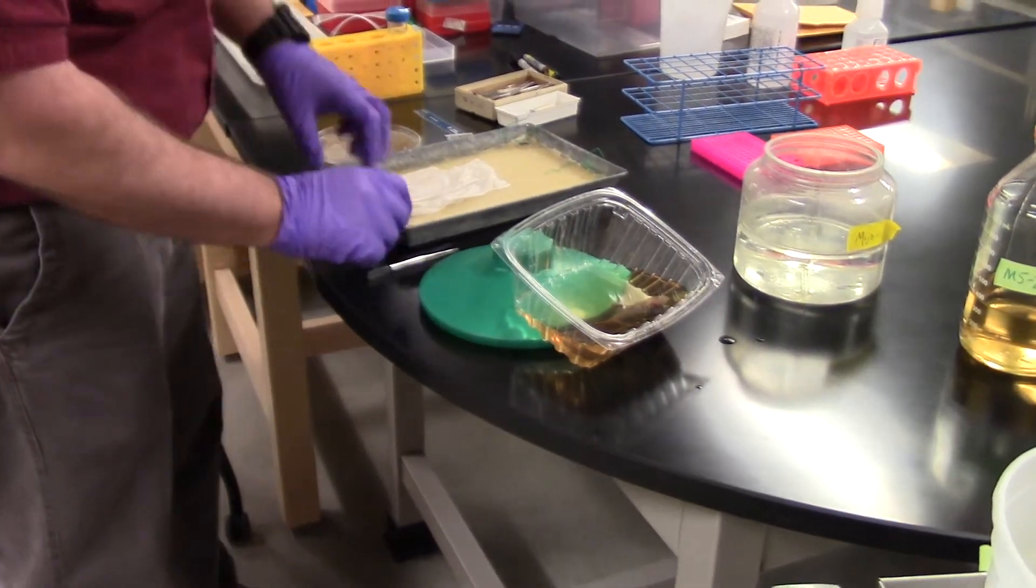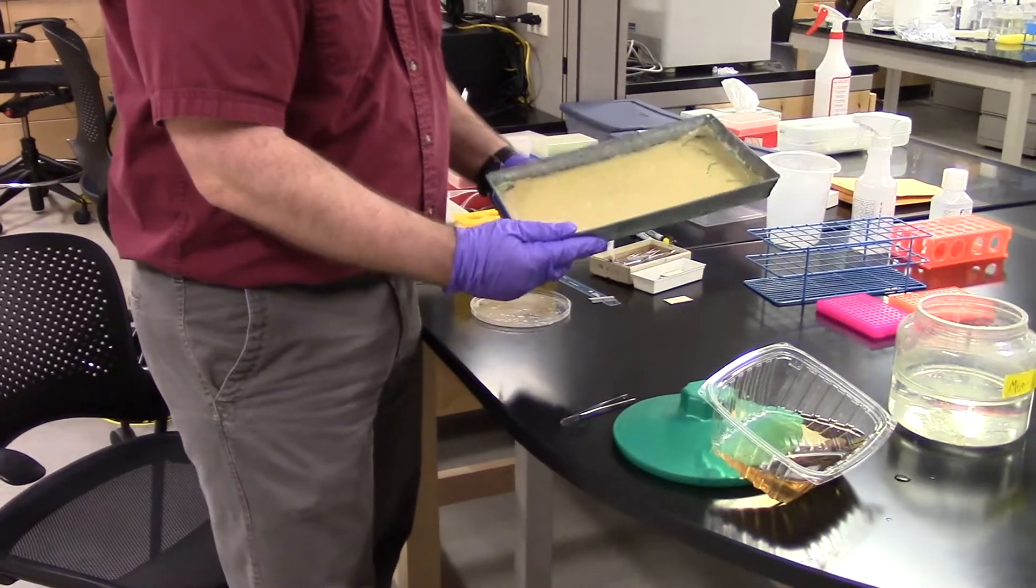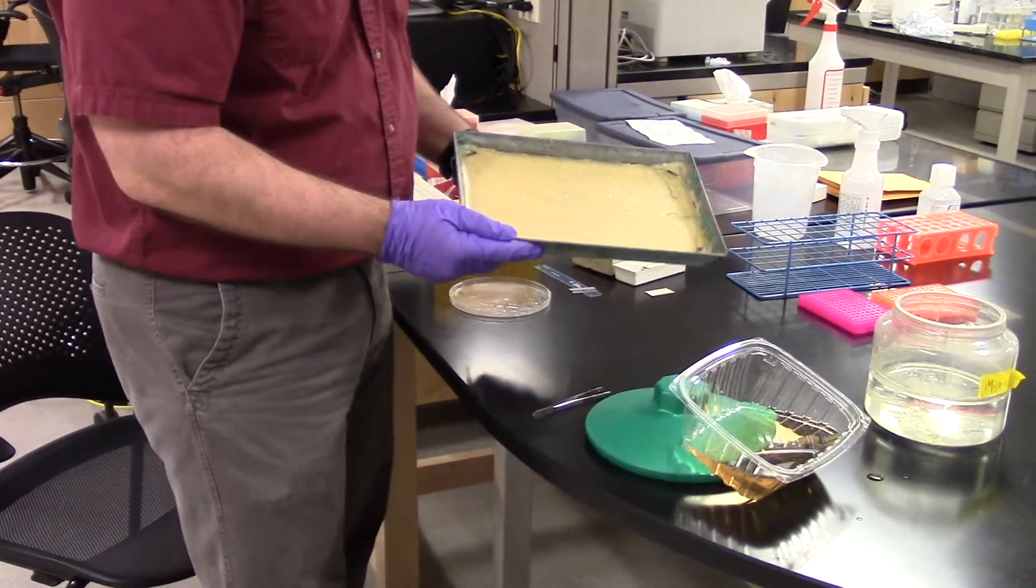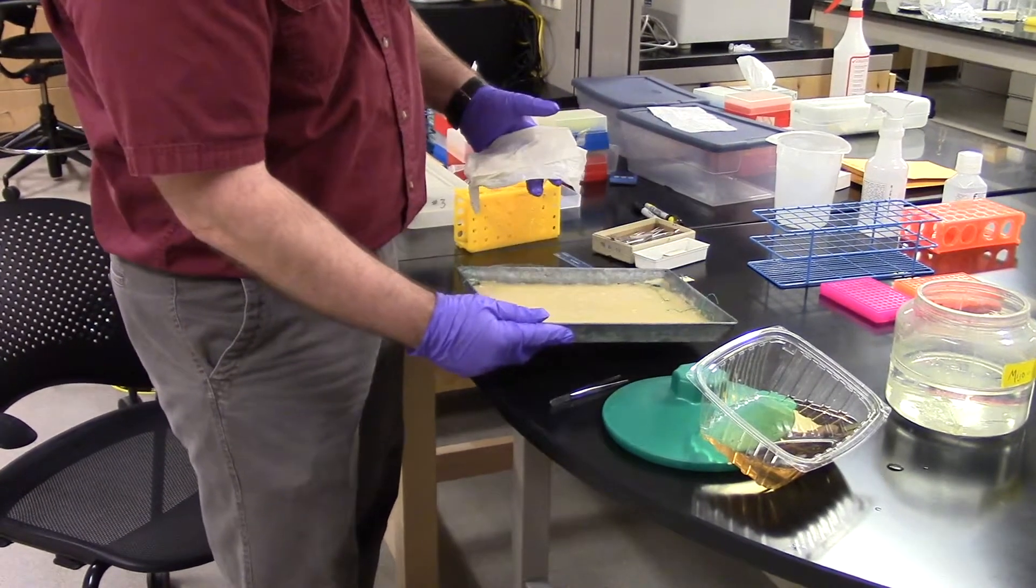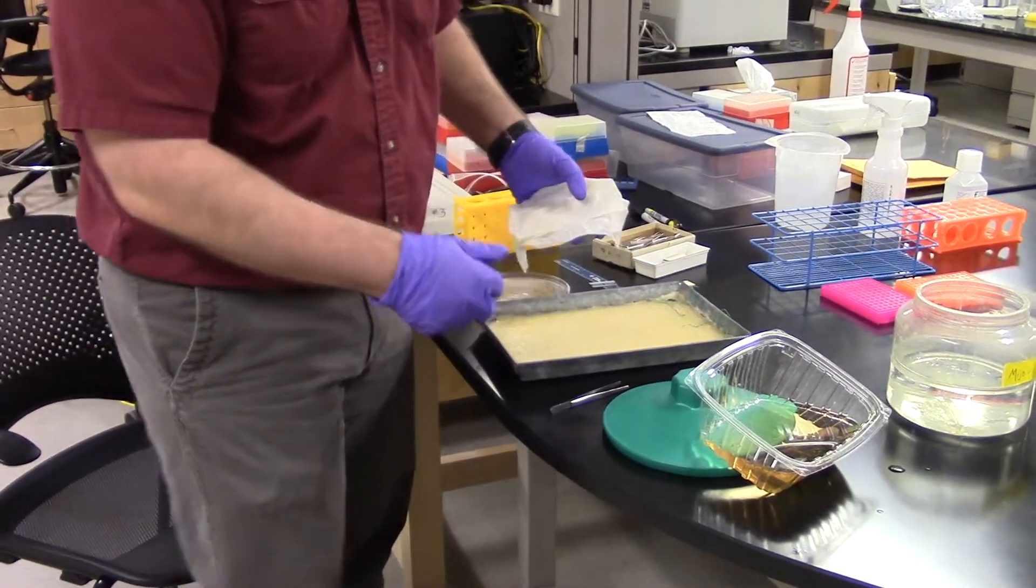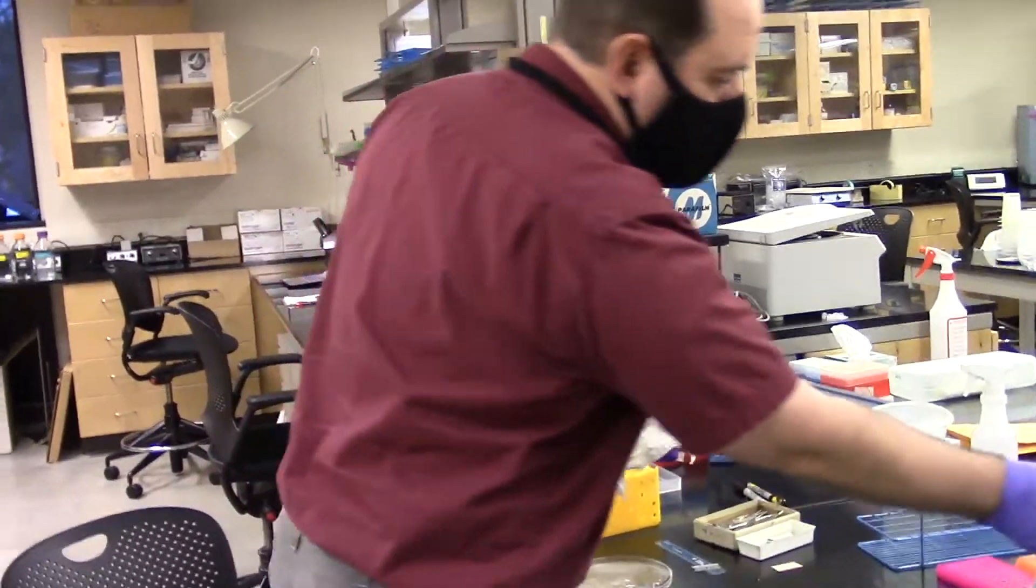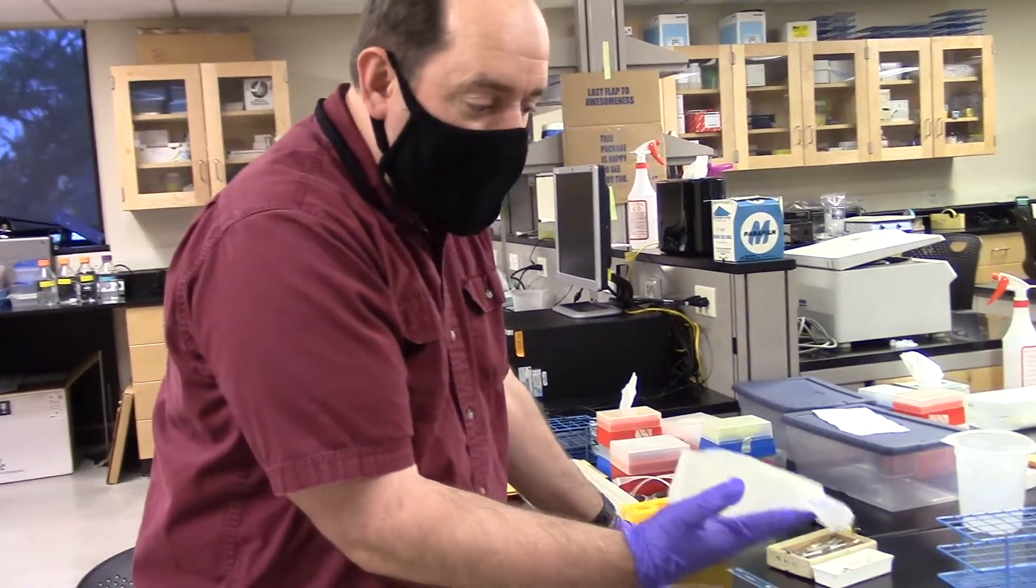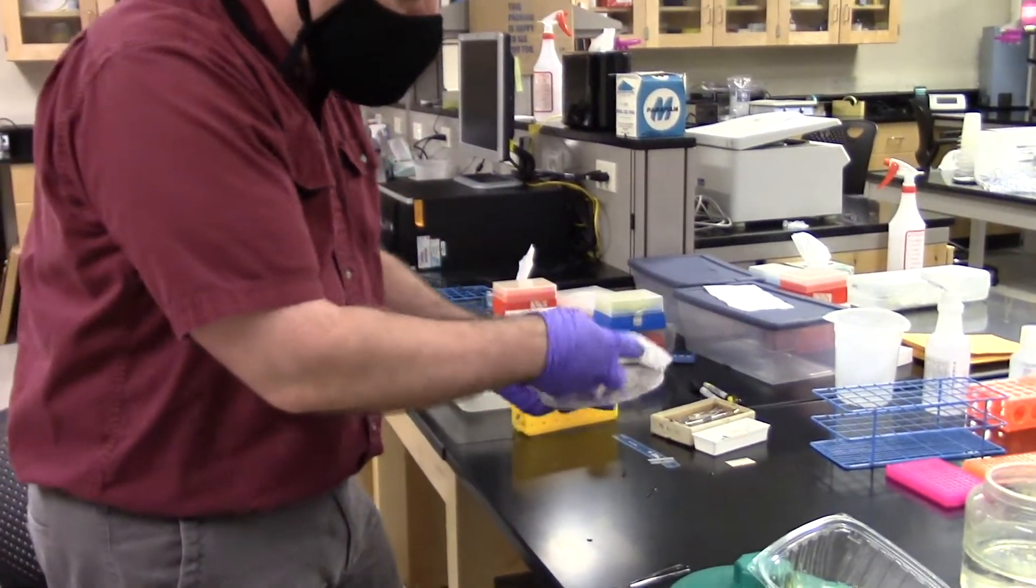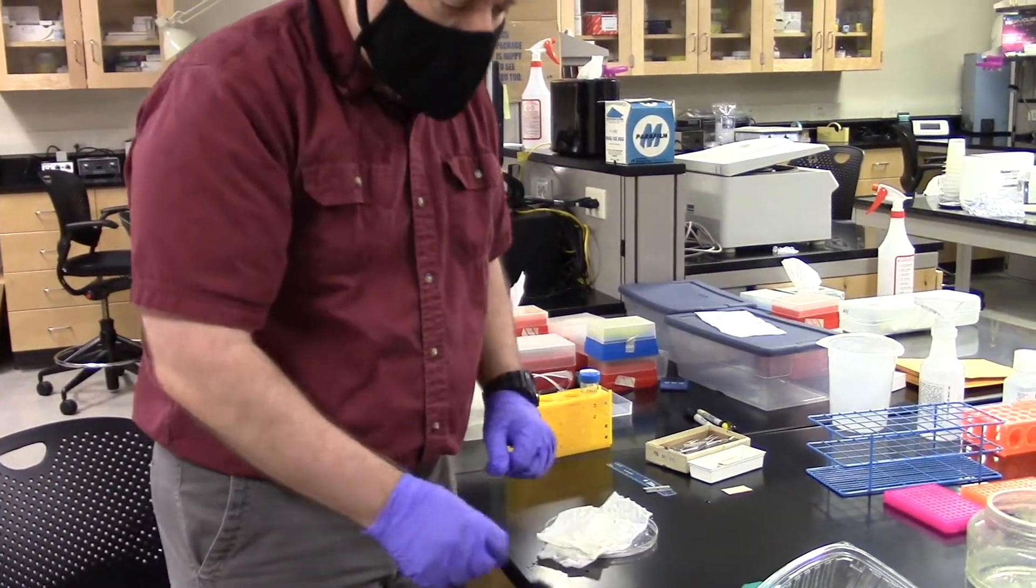So our axolotl is ready for surgery. You may recognize this dissection tray from dissections you might have done, like cat dissection or in organismal and ecological biology lab. We actually don't use these for axolotls. The reason is because they breathe through their skin. I've got some wet paper towel and I'll just use a large Petri dish and lay him on this dripping wet paper towel.